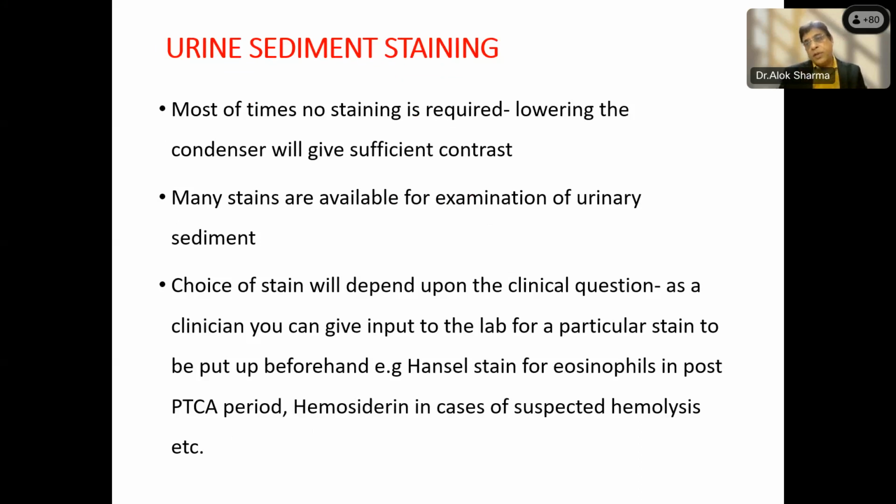Now, coming to the staining or the visualization part, I just told you that most of the time you will not require any staining, and just lowering the condenser on a fresh coverslip slide would give you a lot of information. However, having said that, there are several stains available which you can use on the urinary sediment, and the stain you choose would depend on the clinical condition in question, right? You can't put so many stains over every specimen. So depending on which clinical background the case has arrived with, you can choose to put certain stains.